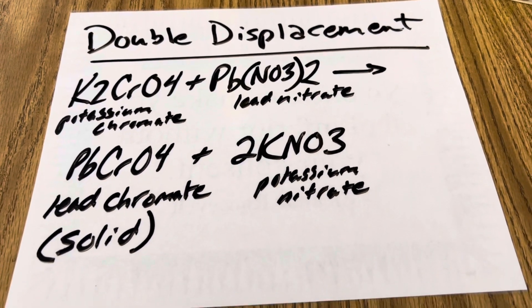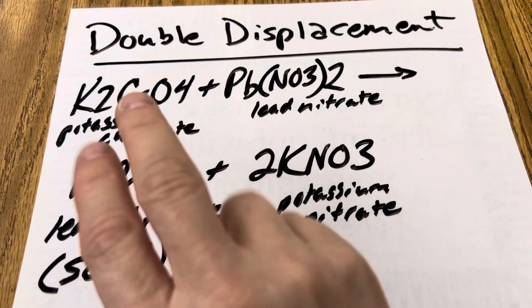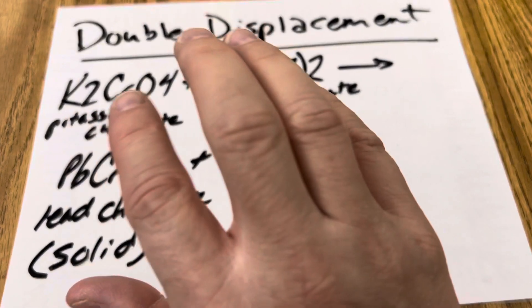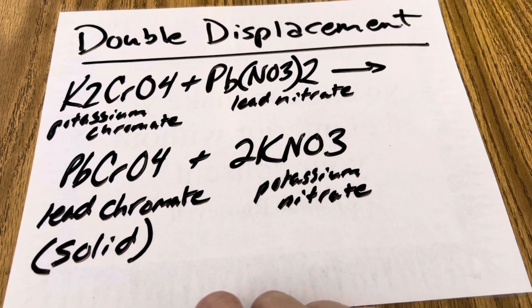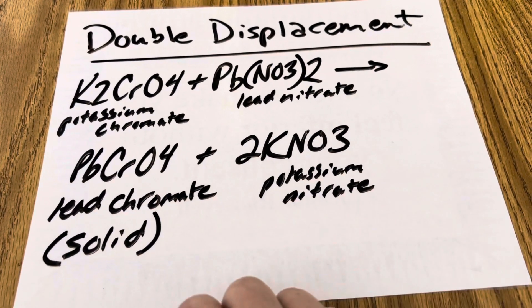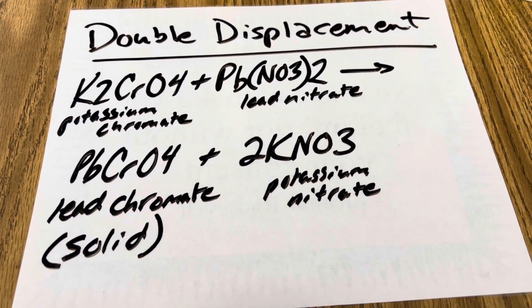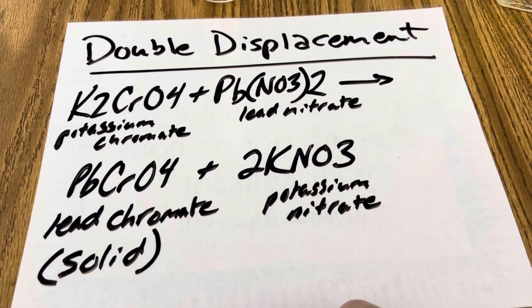What's happening in this awesome experiment is you've got an aqueous solution of potassium chromate and lead nitrate as your reactants. When both of these are dissolved in water and combined, you create the products lead chromate and potassium nitrate. The metals are trading places with metals, non-metals with non-metals. Your lead chromate is the solid precipitate — that bright yellow solid that appears suddenly between the two liquids. Your other product is potassium nitrate.